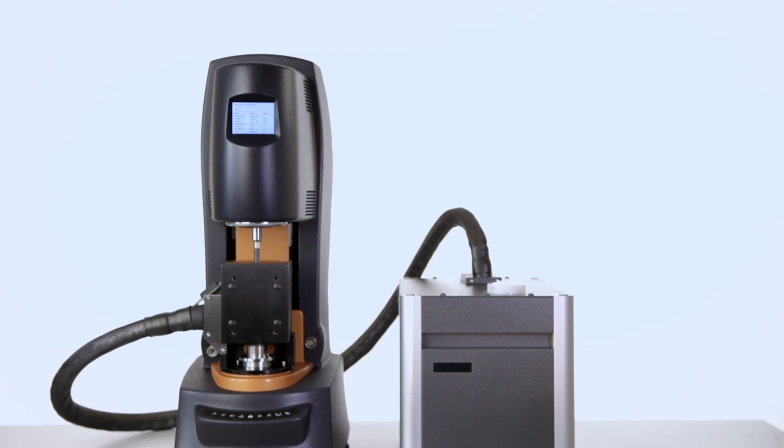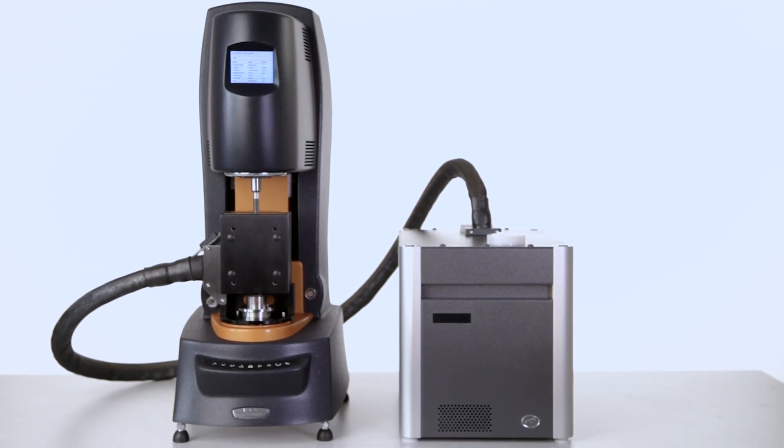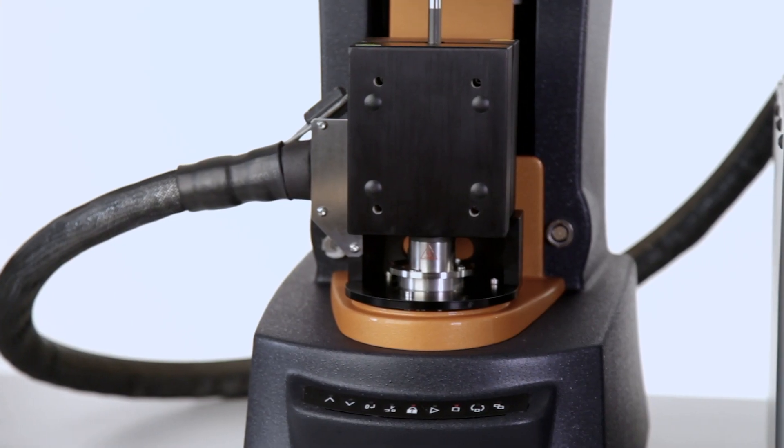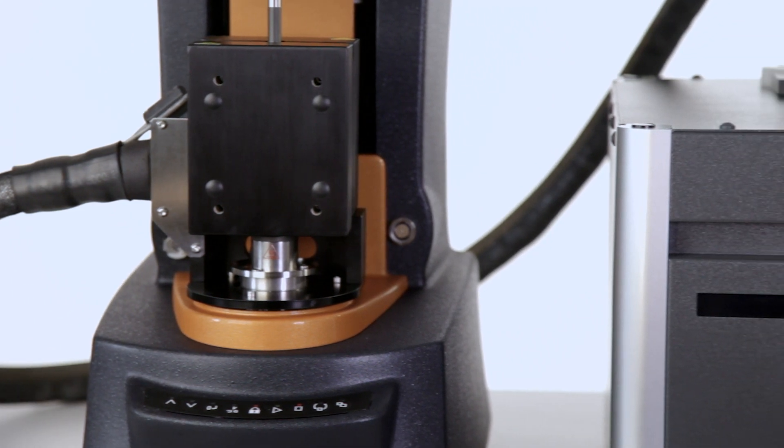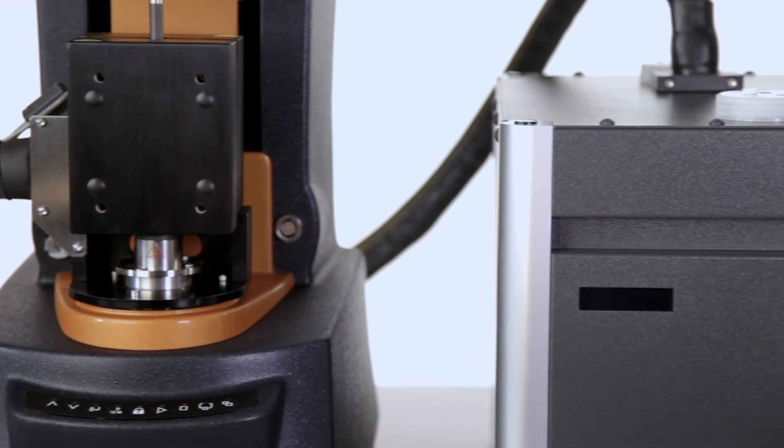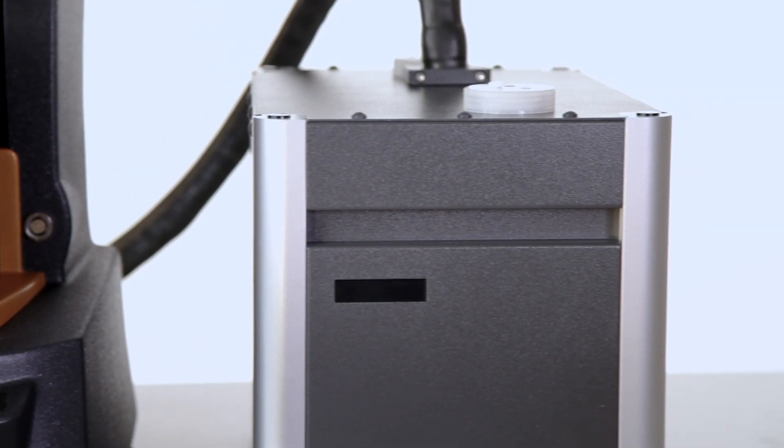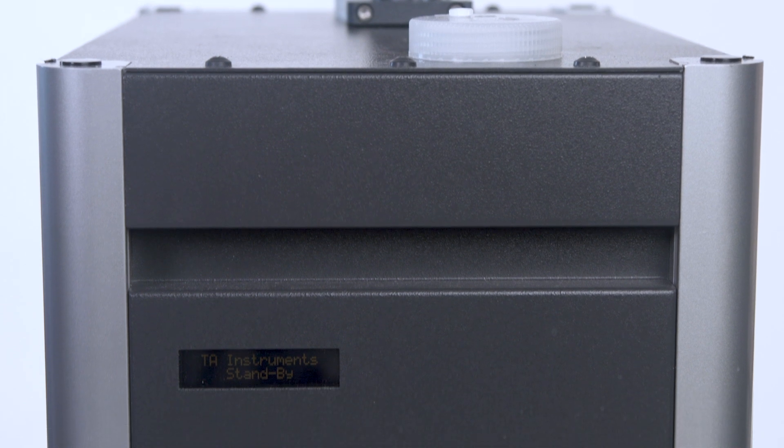The relative humidity accessory on the DHR rheometer is a powerful tool which allows users to monitor the rheological property change of a material under both controlled temperature and humidity.